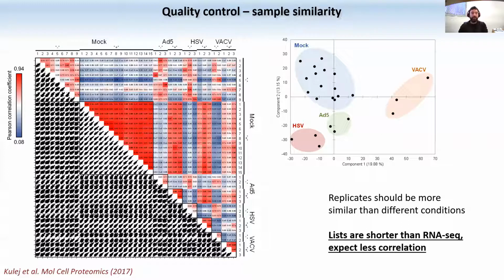So, for example, one way is to display them as a scatter plot. What you see here on the graph is a multi-scatter plot, and you can see, the more they align on a line, the more the different samples are similar to each other, right? Because they have a higher correlation. You can express the correlation with a number, and you can see which ones have a higher or lower correlation. Or you can use one of these unsupervised clustering methods, like, for example, principal component analysis.